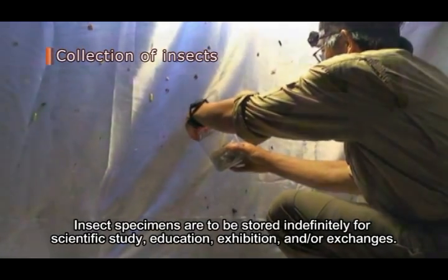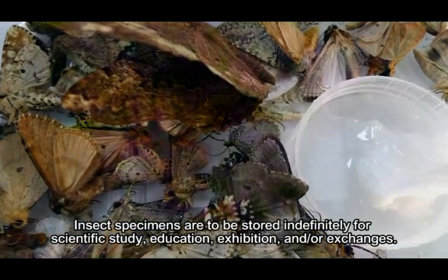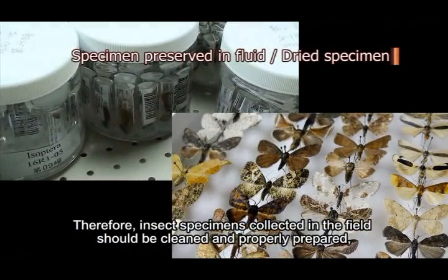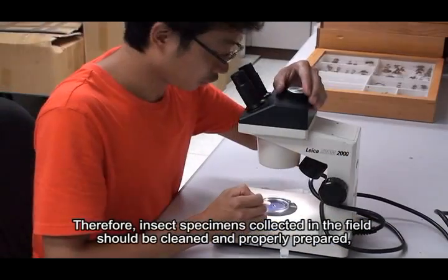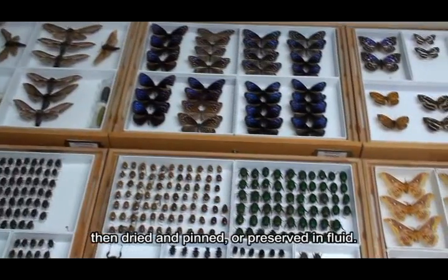Insect specimens are to be stored indefinitely for scientific study, education, exhibition, and/or exchanges. Therefore, insect specimens collected in the field should be cleaned and properly prepared, then dried and pinned or preserved in fluid.